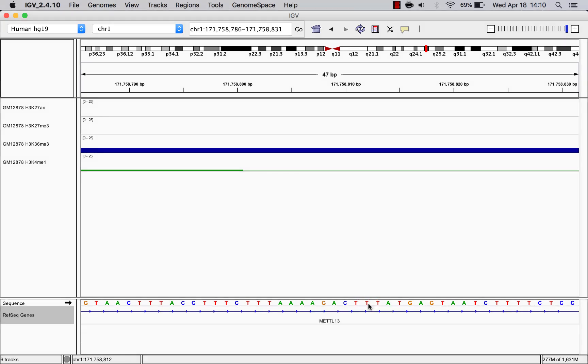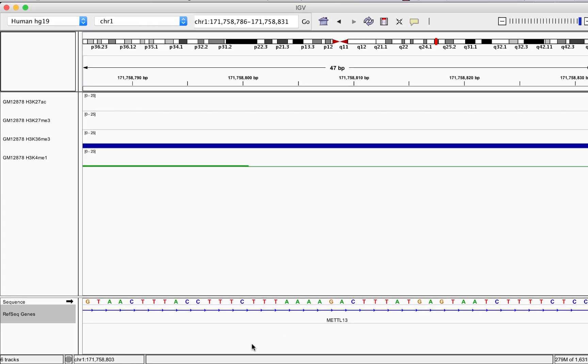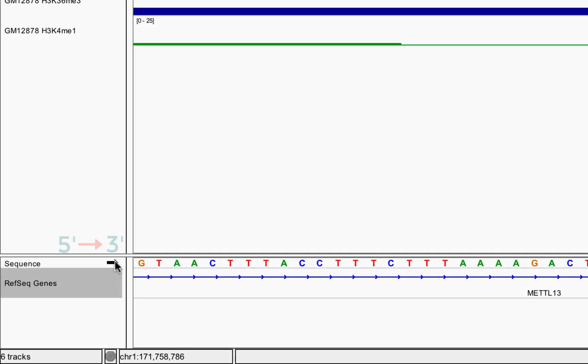By default, the forward strand of the DNA is shown. Clicking the small arrow to the left will reverse the strand.